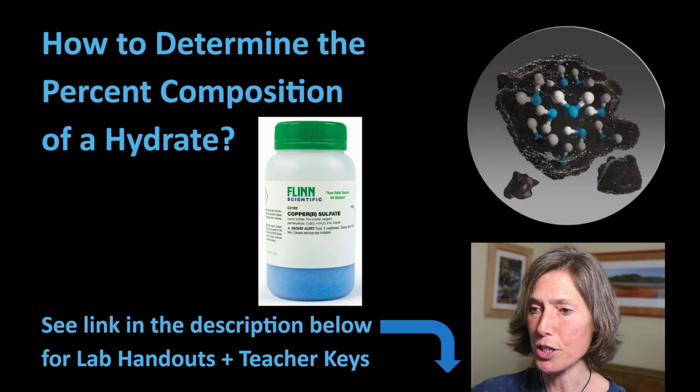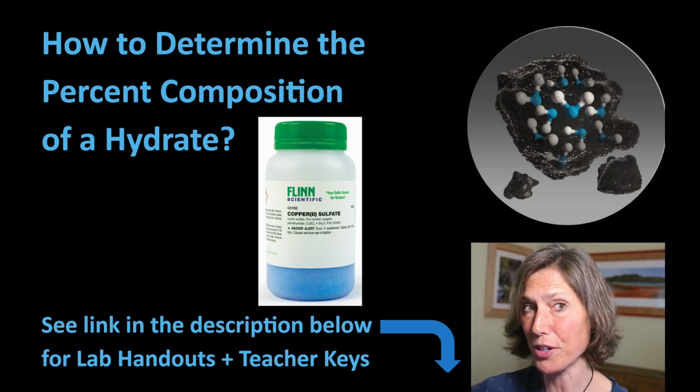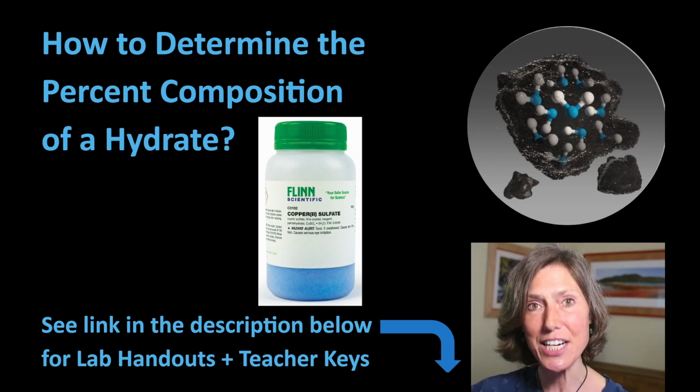For this lab, you can use Flinn Scientific copper sulfate, either crystals or powder. I actually didn't have the powder in my stockroom. I only had the crystals. And actually, I kind of liked it.